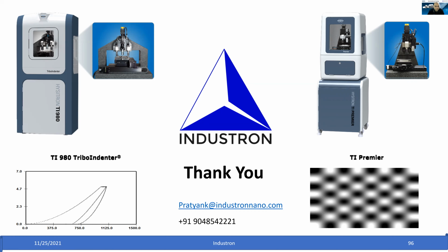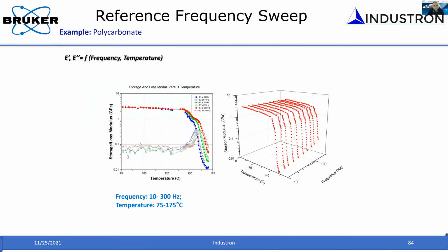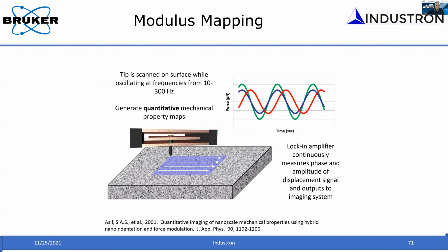Okay, it's a good, interesting question. The parameters that need to be kept in mind if you try to do modulus mapping or any dynamic measurement technique is, the force amplitude that you apply has to be very, very small.